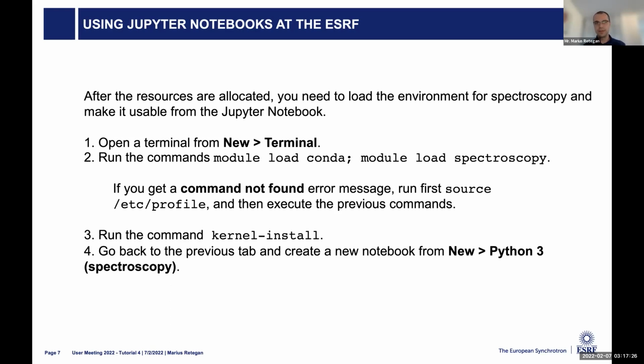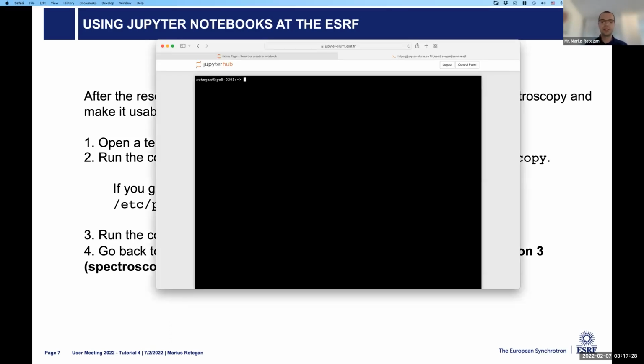So I'm just going to do the same thing. In this terminal, you just type, I can explain to you why, module. Okay. So you should see the thing change to something like this. Yes, excellent. And then you just type the command again: kernel install.